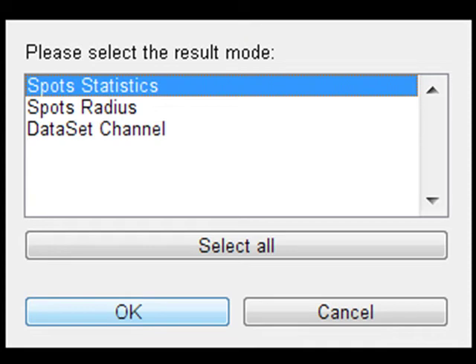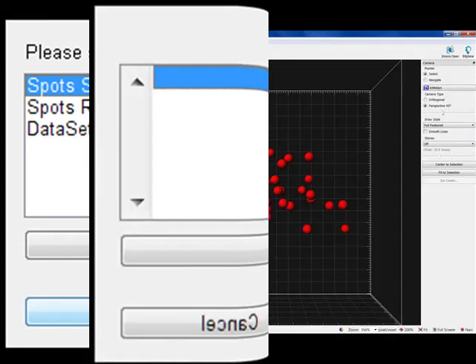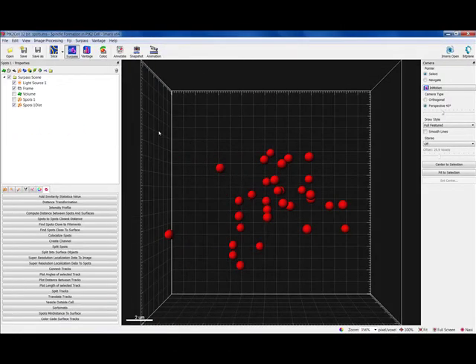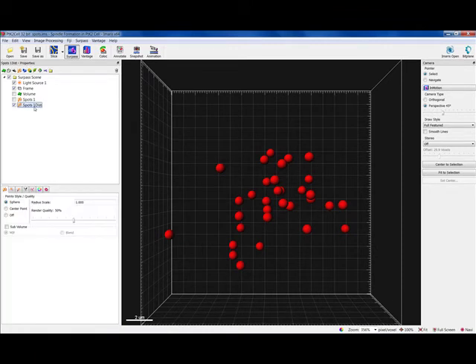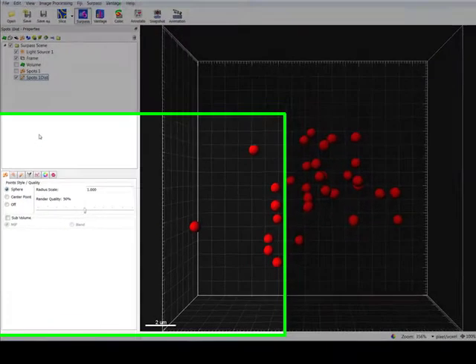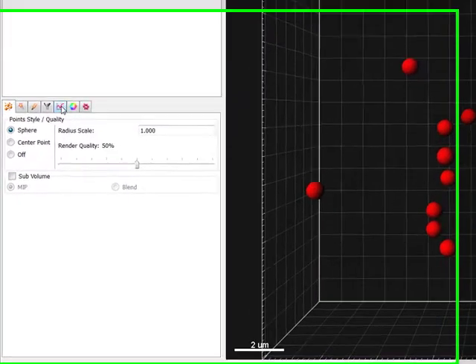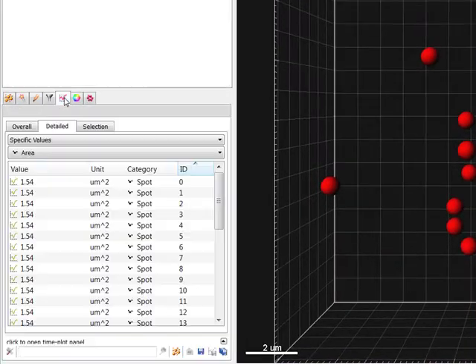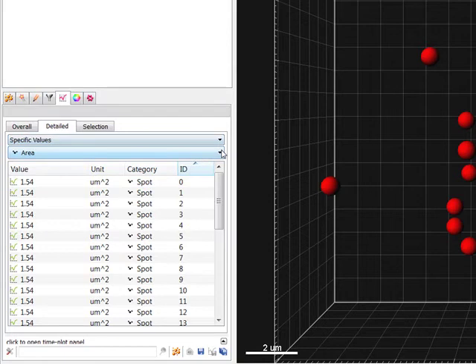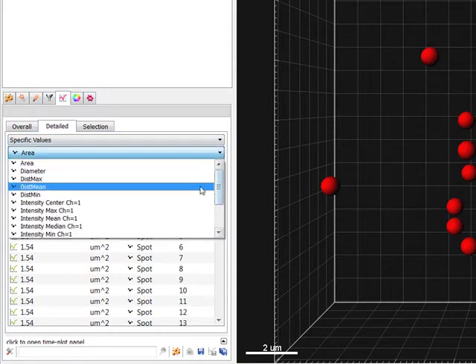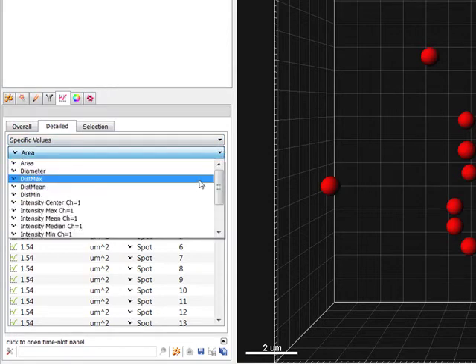If you select the Spots statistic option, a set of new variables is added under the Statistics tab. A new Spots object is created and, under the Detail tab in the Specific Values, three new types of distance measurements are available: Maximal, Mean and Minimal.